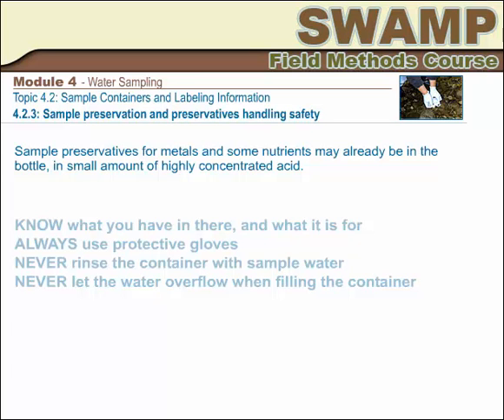In any case, this involves handling very corrosive substances. Utmost care must be exercised. Always wear protective gloves. If you are filling containers that already have preservatives, never rinse the containers in sample water and never let the water overflow.